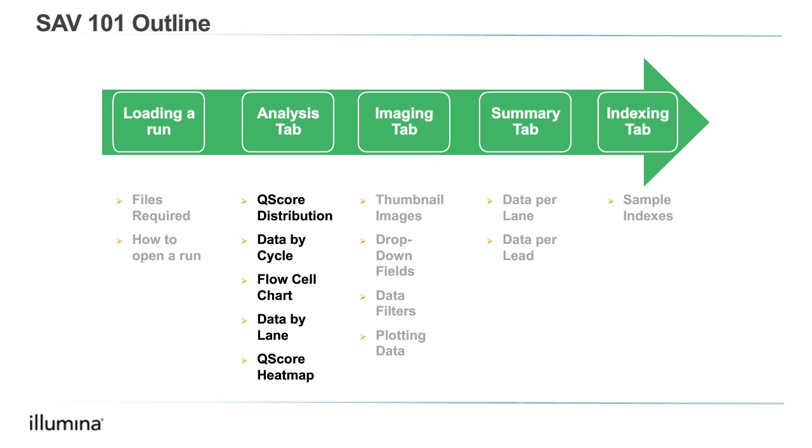Next, let's discuss what is reported in the Analysis tab of SAV, as this will be the first tab that populates when you load your run in this software. The Analysis tab contains the majority of information at a glance, so we will focus on this tab for the majority of the webinar.